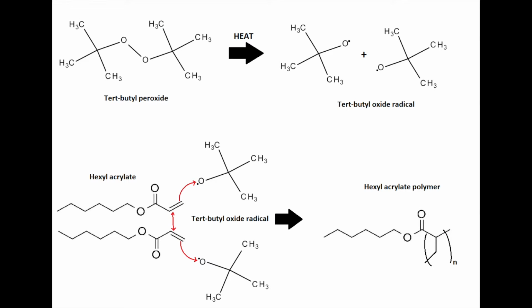Today we will be discussing chemical vapor deposition technology on a silicon wafer. Hexyl acrylate is vaporized and acts as a monomer, which is polymerized to the wafer surface. This reaction is initiated with the free radical group on cleaved tert-butyl peroxide, which breaks the hexyl acrylate's unsaturated bond. This allows for multiple hexyl acrylate molecules to continuously react to each other to form a polymer.